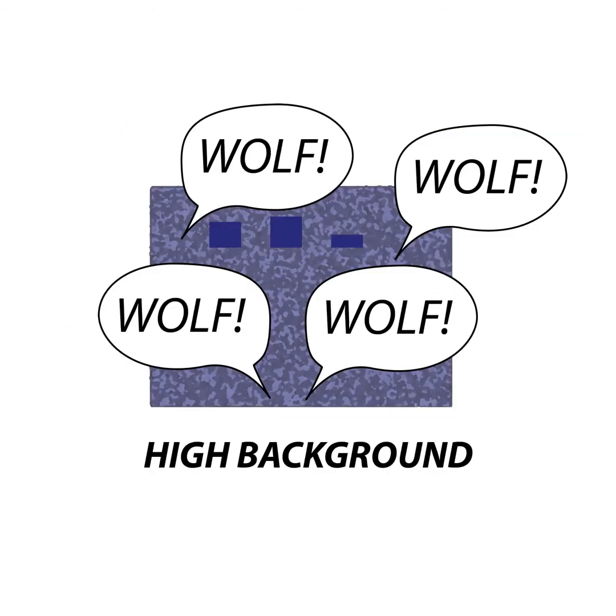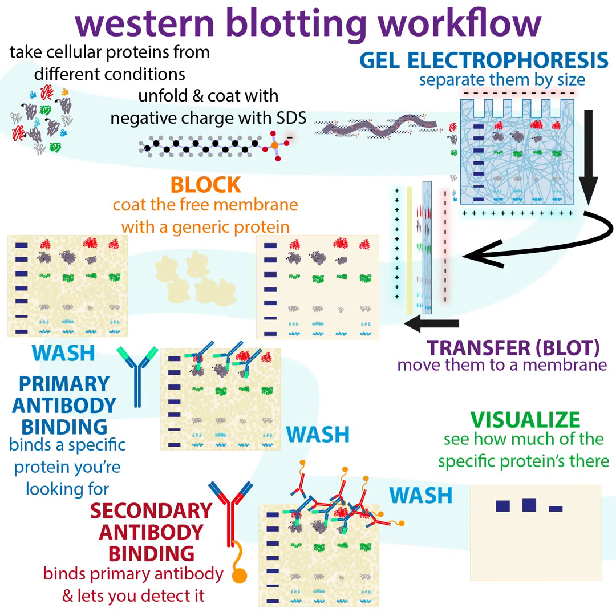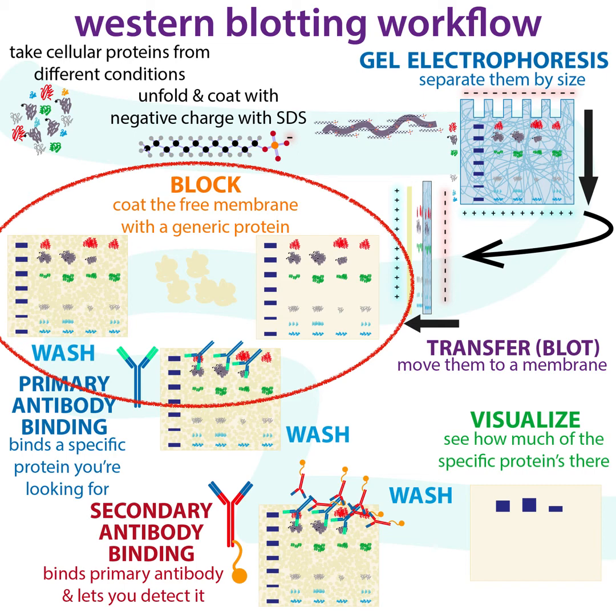But we skipped a step in our explanation, because if you were just to do that, you would get really high background. So you'd have a lot of crying wolf, basically. As we talked about in the very beginning, our membrane is kind of like sticky glue for protein, or like duct tape for protein. And our antibodies are proteins, so our antibodies are just going to stick to that membrane unless we block it. Basically, blocking just means we take a generic protein like BSA, bovine serum albumin, or even milk. A lot of times you make a milk solution with powdered milk, and often detergent. So the buffer is often TBST, so tris buffered saline with Tween.